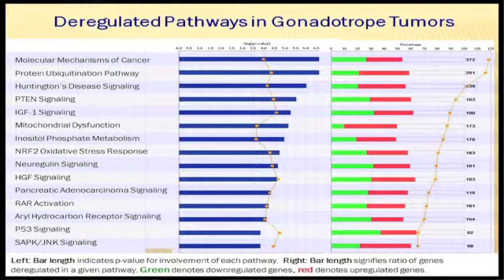In particular, obviously you see this P53 signaling pathway. That might be a good one, there's a history of P53 involvement in cancer. This might be something we want to investigate. But again, it's this connection, and you're getting more depth out of the list of genes you think are different in your study. So let me give you an example of that and how you can use this connectivity to help guide your analysis.